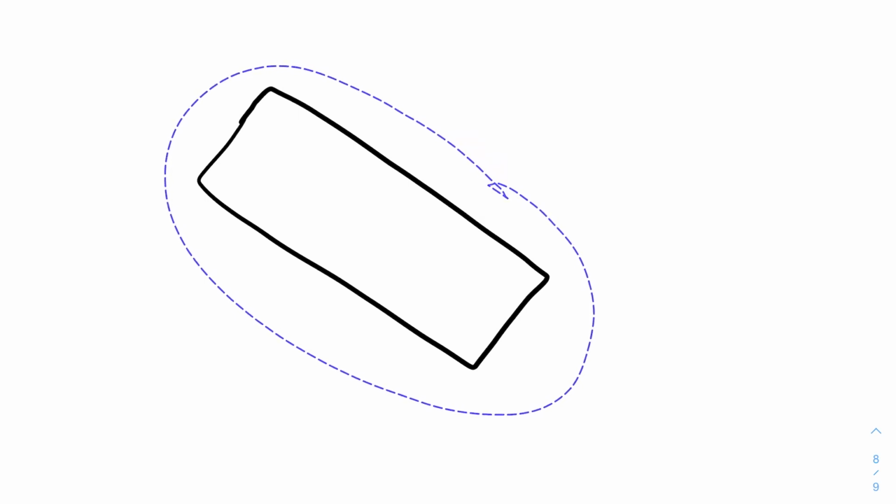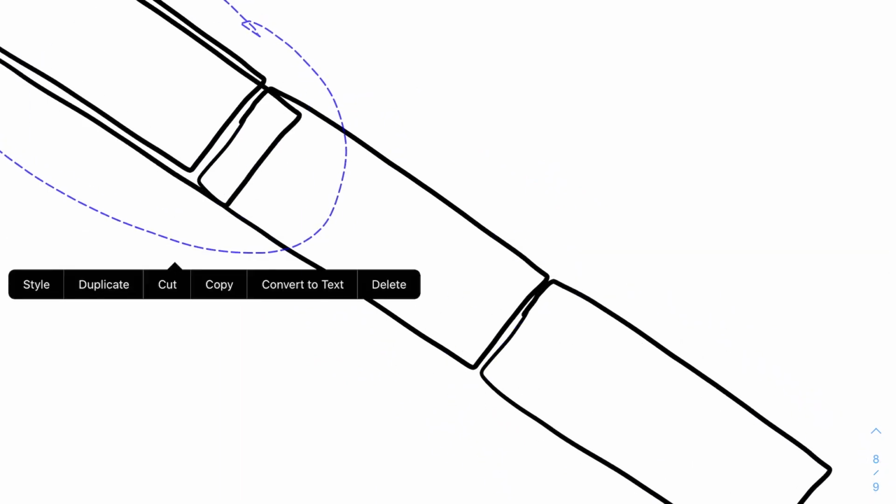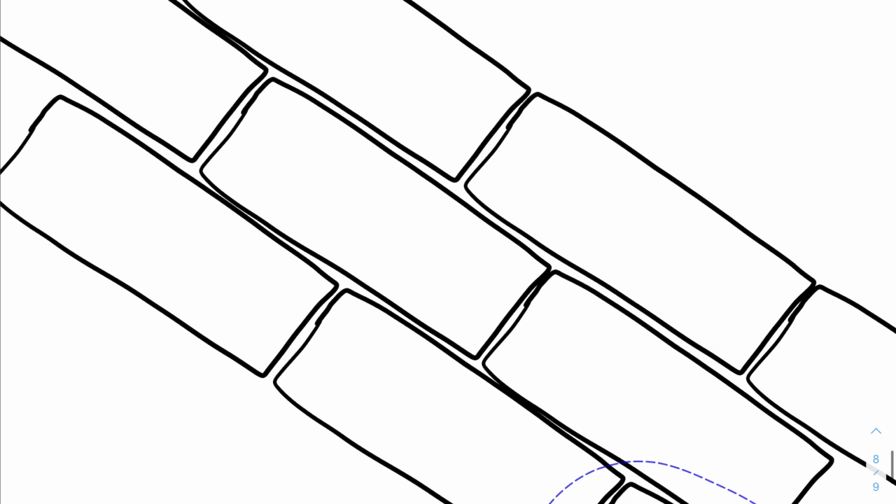So now that we have viewed our onion cells under the microscope, we're now going to draw them out and draw out what we have seen. So as you can see on the microscope slide, they are of this rectangular, elongated cell structure, and we're going to duplicate a couple of these cells out. There, so we have our arrangement of our plant cells.